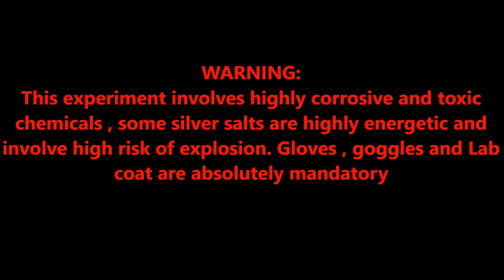Warning! This experiment involves highly corrosive and toxic chemicals. Some silver salts are highly energetic and involve high risk of explosion. Gloves, goggles, and lab coat are absolutely mandatory.